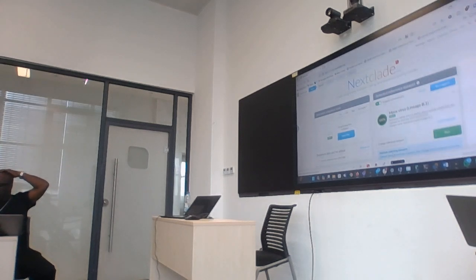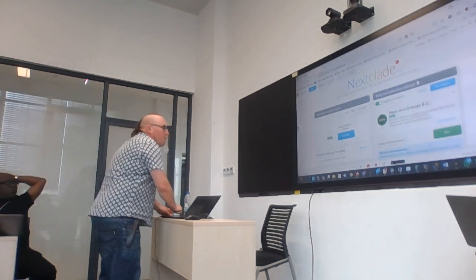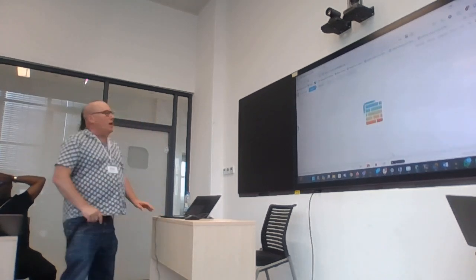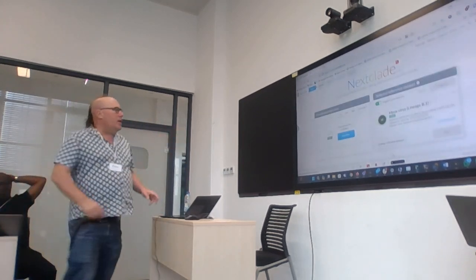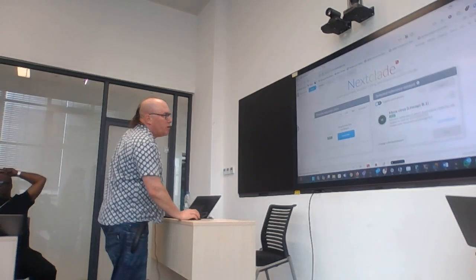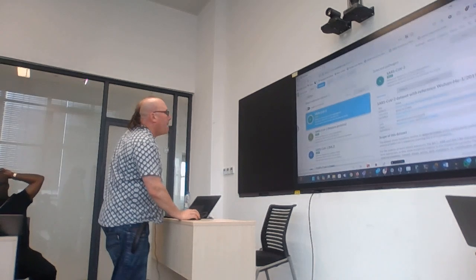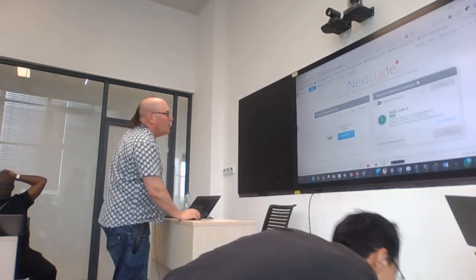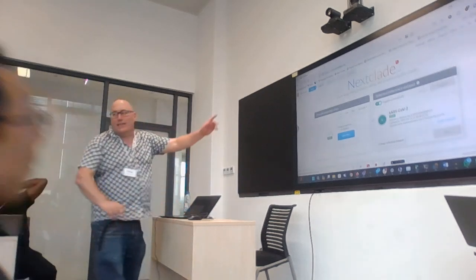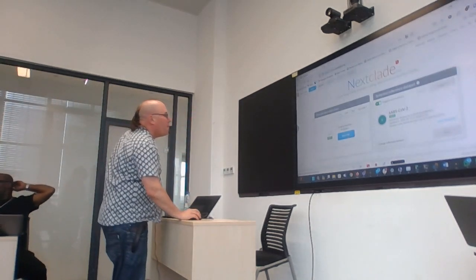Because this one, I actually want us to start from zero. If I reload this page with nothing, then I'm just going to choose a different reference. This is a starting point. I'm going to choose SARS-CoV-2. So now I'm going to switch this button, suggest automatically, on. Now I'm going to select my data.